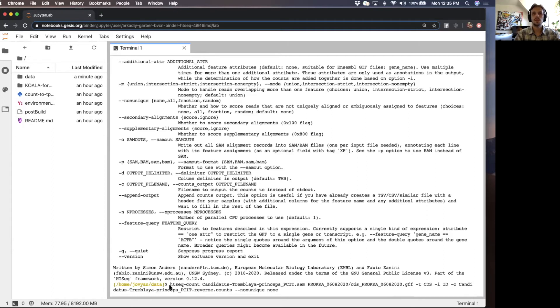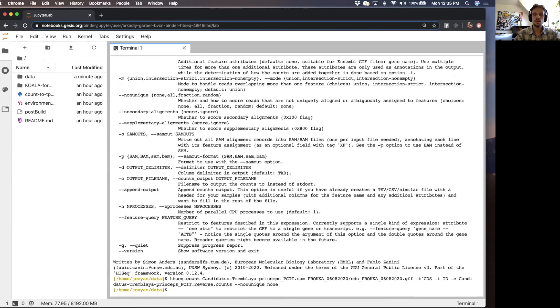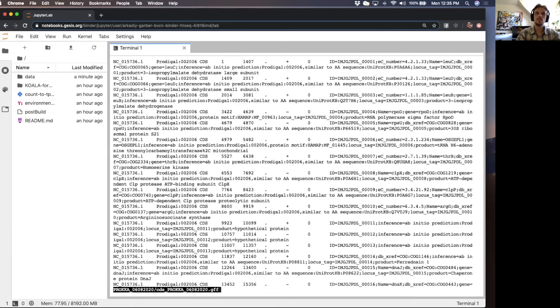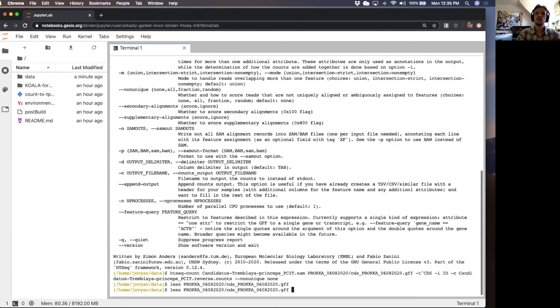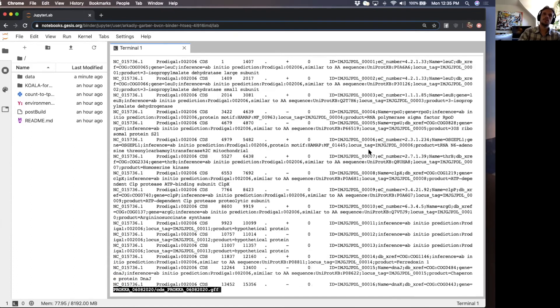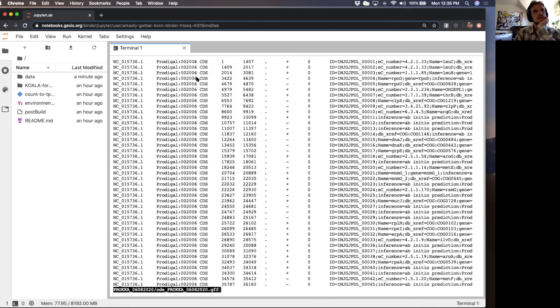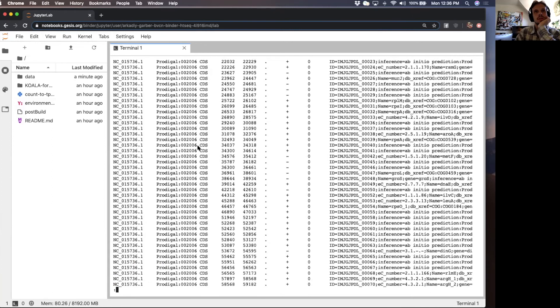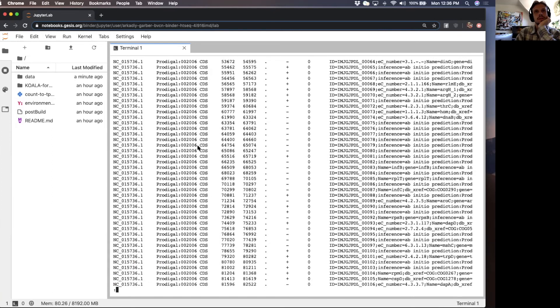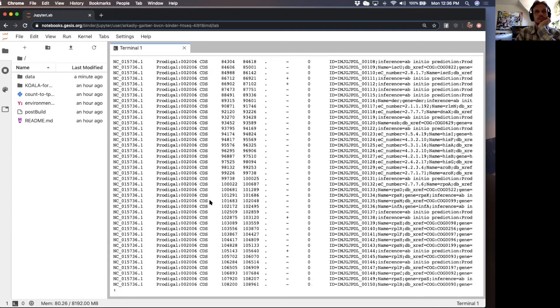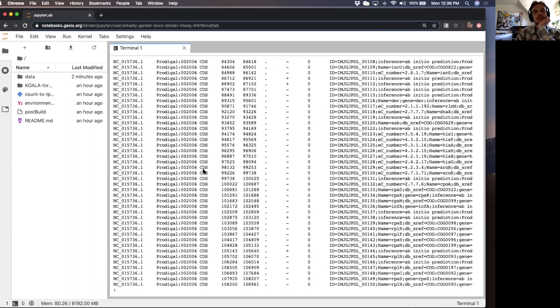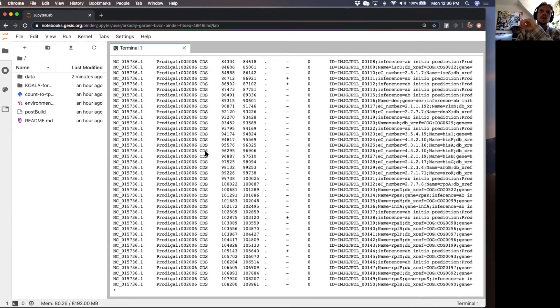Before I paste this command, let's look at our GFF file because there are certain important parts of it that we want to know. Two pieces of information are important to know from your GFF file if you want to run HTCount. The first is this third column. When you run HTCount, you want to specify which gene feature you're actually interested in. When you have an output from Proca, you're going to have all the gene features combined in the same GFF file: CDS, tRNA, mRNA, rRNA, tmRNA. When you run HTCount, it's going to ask you to verify which gene feature you want.